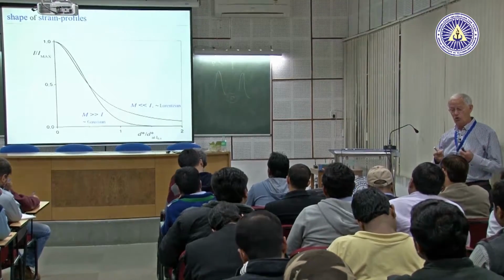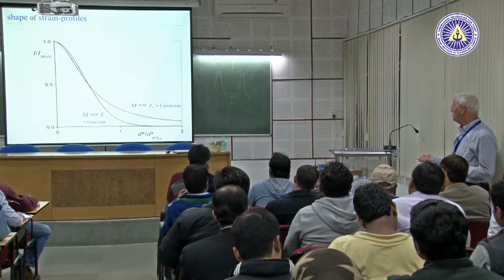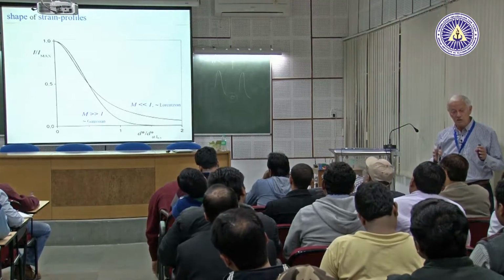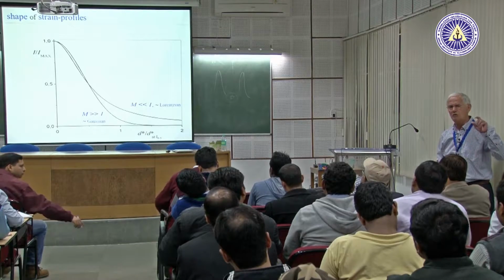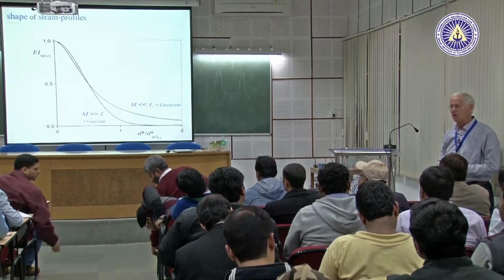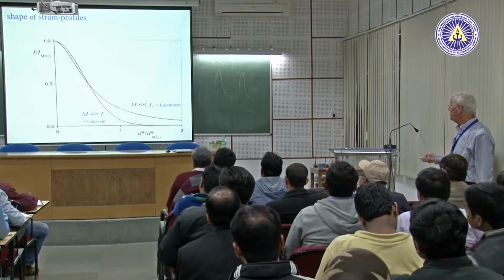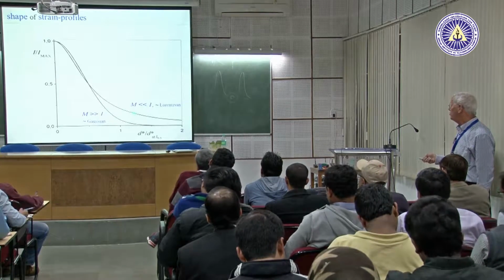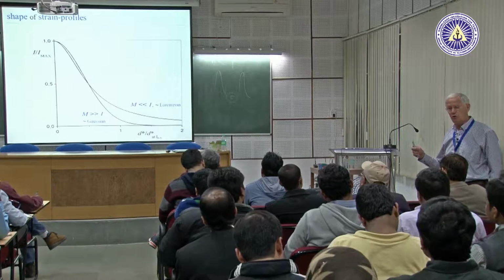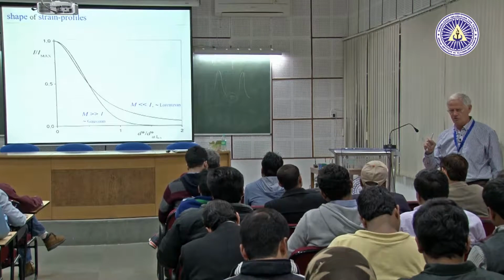If the M parameter, the arrangement parameter, is very large, that means the screening is weak, it is better to say that the dislocations have a dipole character or a weak dipole character. Then the tail is short. In the upper case, the profile function is similar, not exactly, but similar to a Lorentzian function. In the other case, it is not exactly, but similar to a Gaussian.